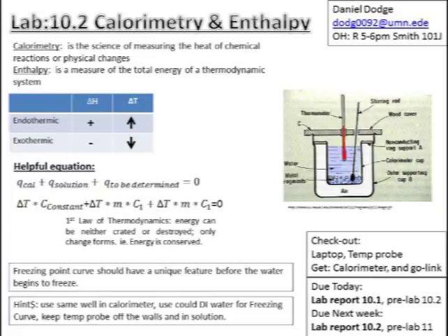We're going to use a calorimeter, a very basic one, just a piece of styrofoam with a couple holes melted into it. So you can use the same well every time, so that your calorimeter constant should hopefully be consistent for each trial. And you're going to use a different amount of water every trial, so you should be able to calculate the change in energy of the water and the change in energy of your calorimeter.